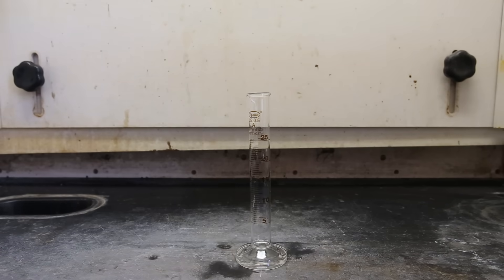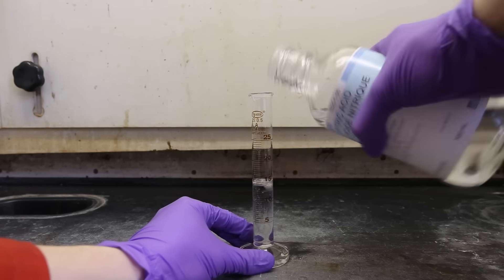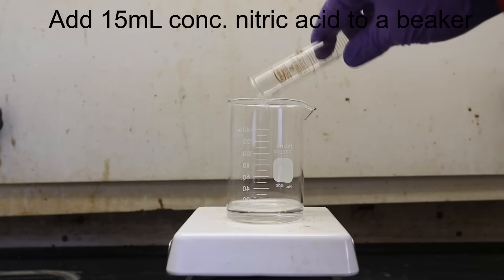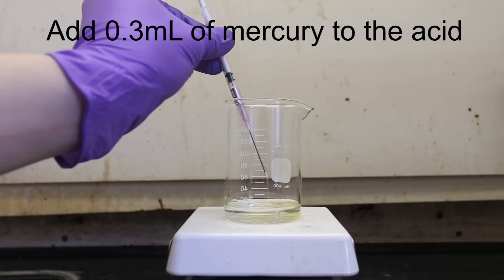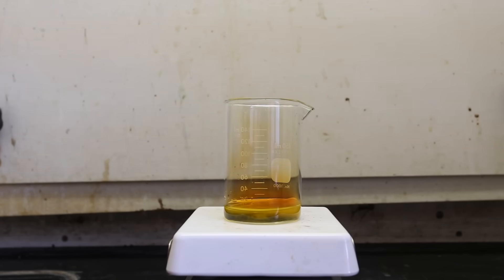About 15 milliliters of concentrated nitric acid was prepared — it doesn't have to be exact, as the nitric acid is already in significant excess. The nitric acid was then transferred to a beaker. About 0.3 milliliters, or 300 microliters, of mercury was measured using a syringe and added to the nitric acid. Immediately after the addition of the mercury, the solution starts to turn green and bubble.